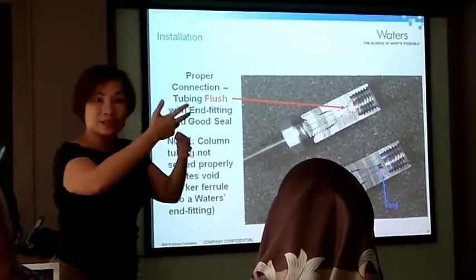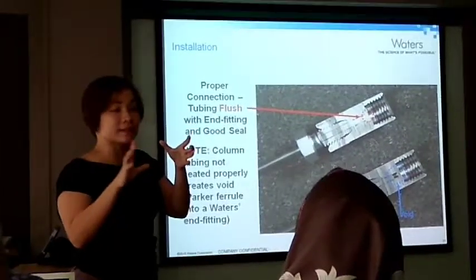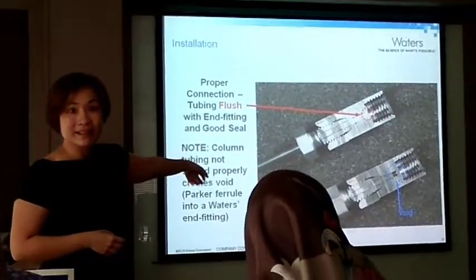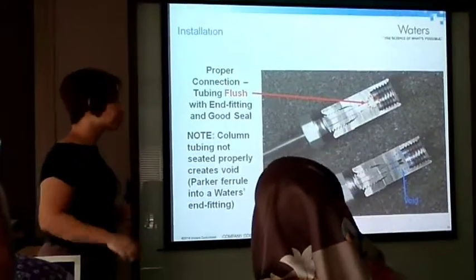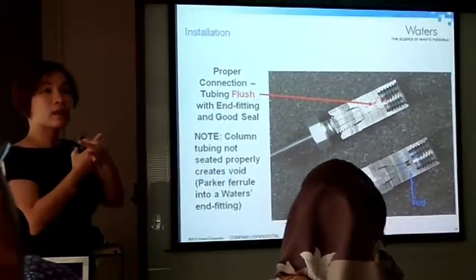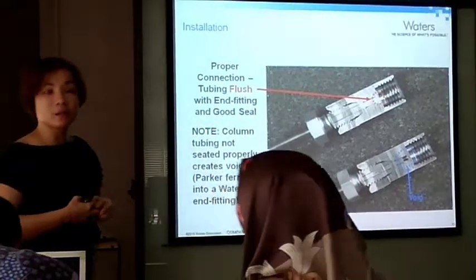That is because the pressure shoots to a level whereby the PEEK tubing cannot hold it anymore. So the pressure resistance of PEEK tubing is not as high as stainless steel tubing. That is something we have to balance: PEEK tubing versus stainless steel tubing. But for an HPLC method, the PEEK tubing should be able to withstand the pressure of the HPLC system or the HPLC column.